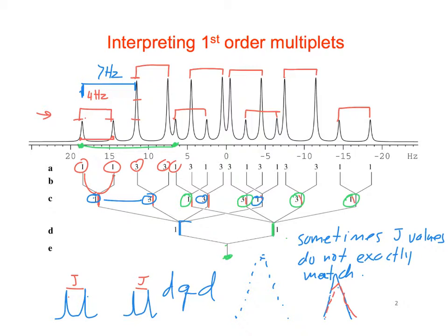Yes. So this is more that you have a certain number of points that you actually sampled in your FID. So it could have however many points it measured as it was going like this. Sometimes, I don't know, on the 500, maybe they always sample 32K now. And so you could probably zero fill even more.